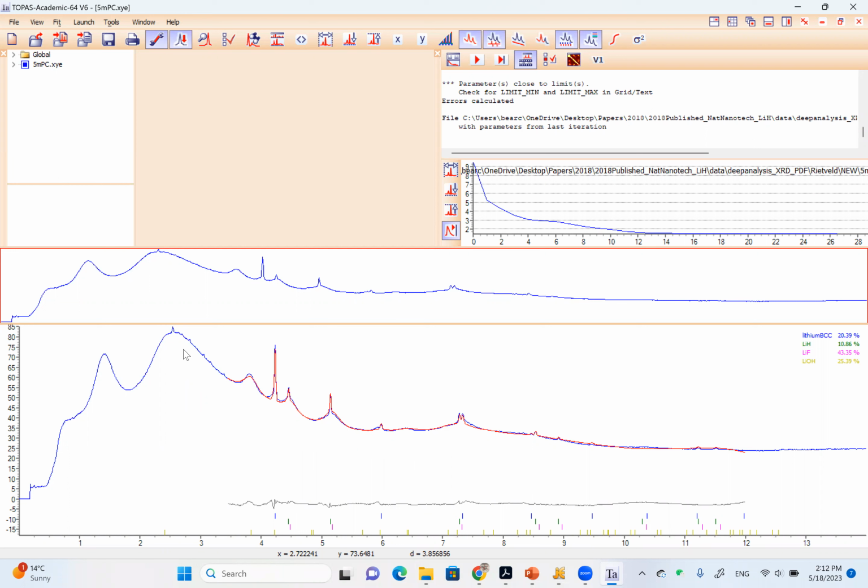It's from the sample, because when measuring the interface samples, we should always measure the background carefully, which means we measure the empty container with the same size, the same exposure time, right? So we should measure that very carefully, and we deduct that portion from the total measurement, including both the container and the air scattering, from that data. And then you get something like this. So there's no contribution from the air or the container.